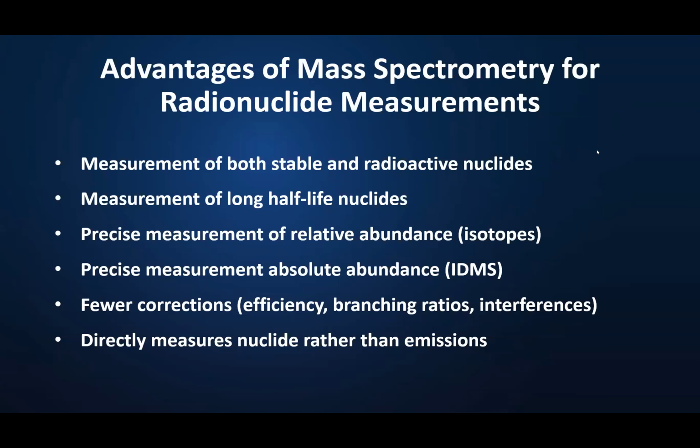Yeah, and while you're typing, I will ask, when it comes to sample preparation, are there significant advantages or disadvantages between the two techniques? The two techniques being mass spec approaches versus our usual radionuclide metrology approaches. Well, I think that's actually a very good question, and like a lot of things, the answer is it depends.